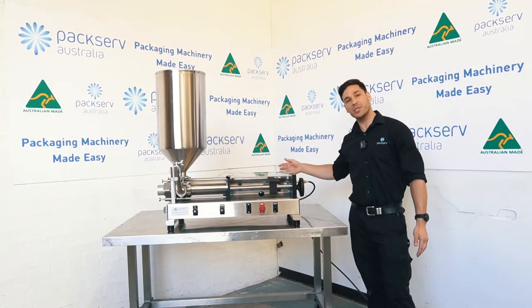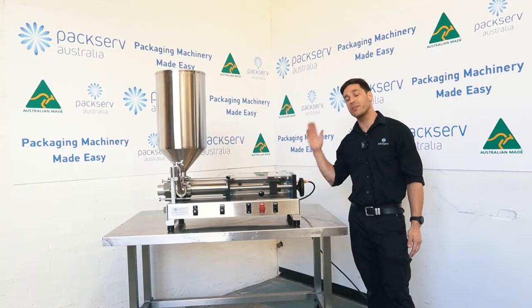First thing I'll do whenever I turn this machine on is check that the air pressure at the rear of the machine is set between 5 to 6 bar.